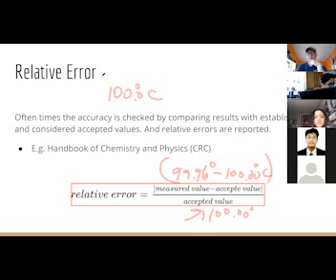By subtracting the volume of the cylinder. Subtracting the volume of the cylinder? The cylinder doesn't really have any volume, because it's open. It can contain a certain volume, but it's not the volume we're going to be subtracting. Mass. We're going to be looking at the mass of the water. Exactly. So by calculating the mass of the water that's actually in here, we're going to be able to calculate its volume.